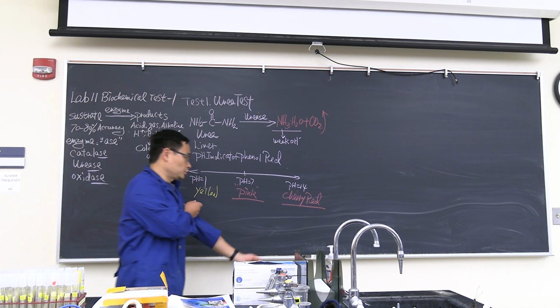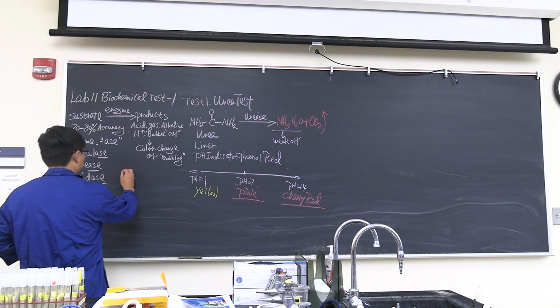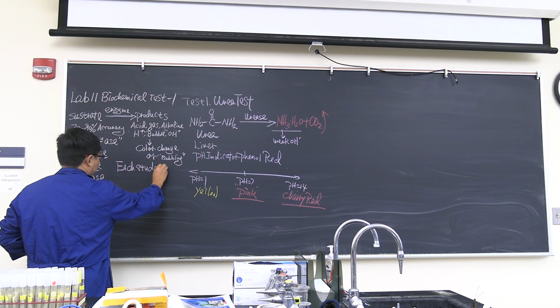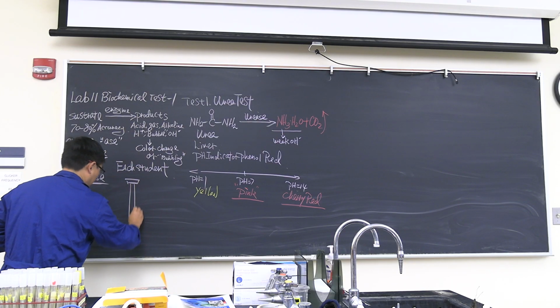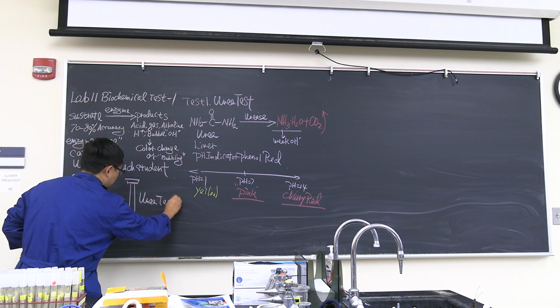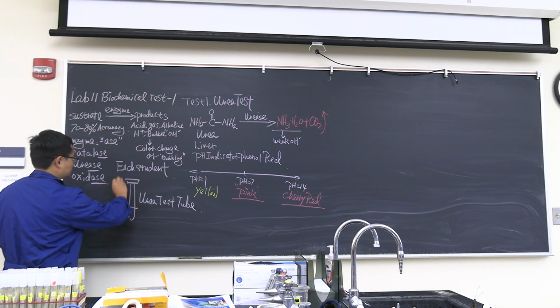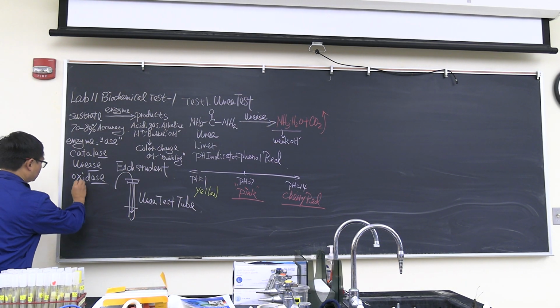So, how are we going to do today's work? Today's work is very simple. Each of you going to grab a urea test tube, inoculate a bacteria.